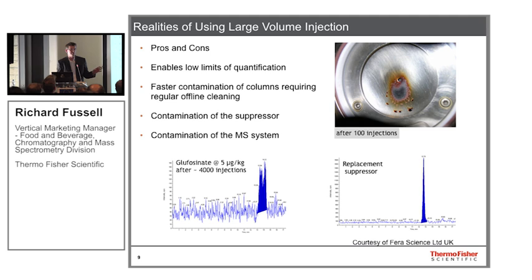We had one set which we ran for a batch of analysis, and then we took them offline, we cleaned them, and then we switched the columns between batches. So we cleaned the columns very frequently, and the columns were in place for maybe a year or maybe 2 years, analyzing thousands and thousands of samples.